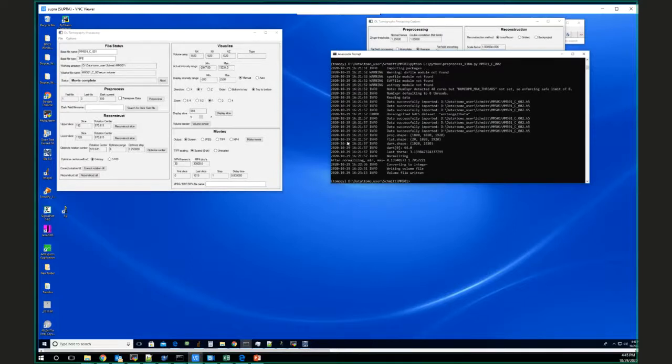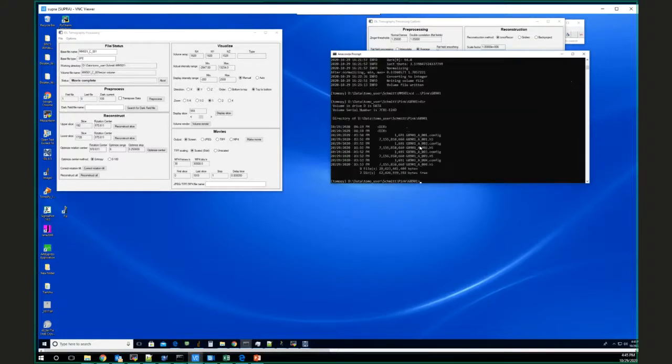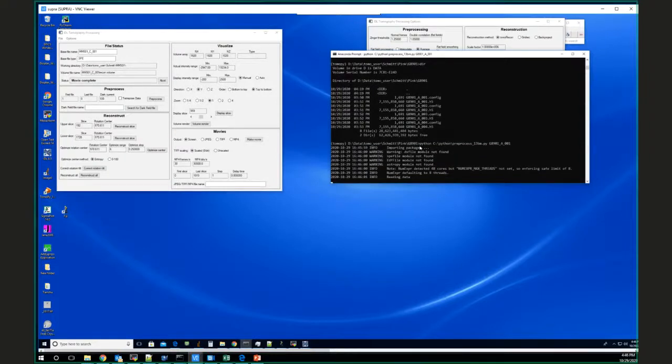But rather than spending the remaining 15 minutes on that, let's go reconstruct the one section of the other sample. That was in pink there. Yeah, so let's reconstruct the top section of this sample. Because this is a breccia, so it's going to look pretty different.